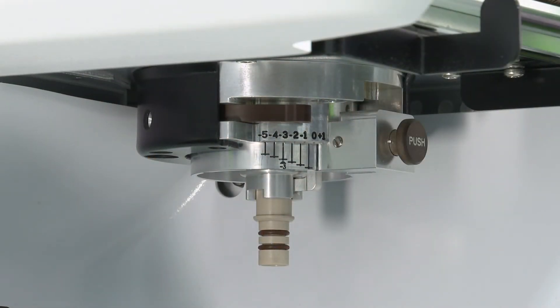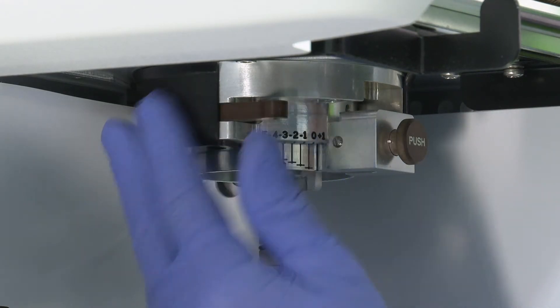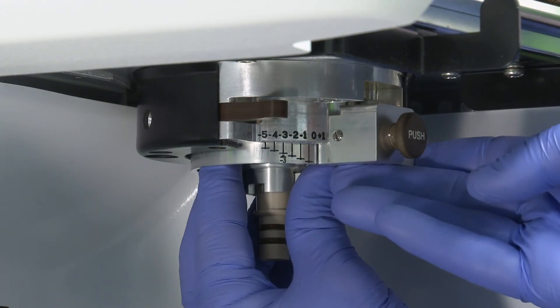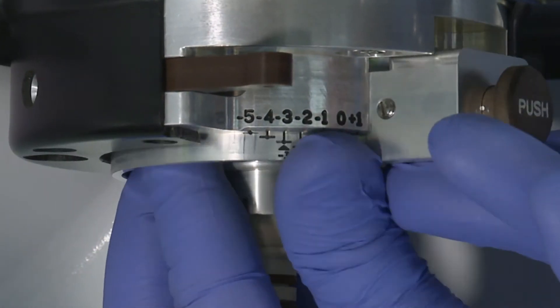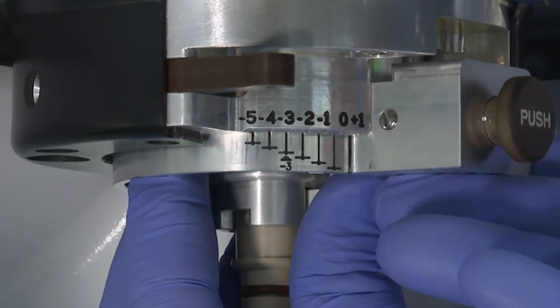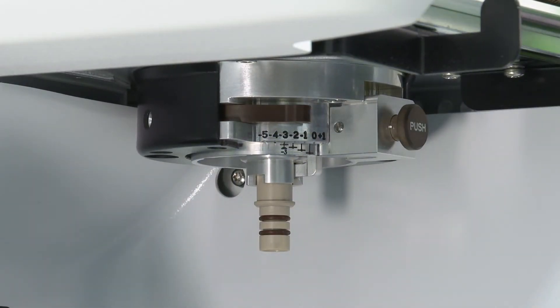To adjust the torch height, pull the torch height locking lever out and then adjust the height so that the horizontal line for the desired position is flush with the mount. Push the torch height locking lever inward to lock the position.